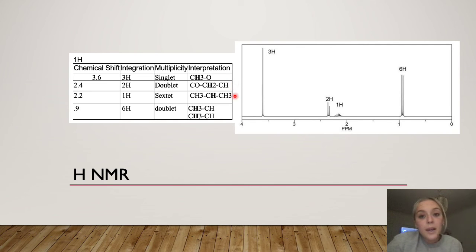And then I moved on down one further, and I saw this multiplet, which I looked at really closely. I zoomed in on it on my computer whenever I was attributing these, and I counted that out to be a sextet, so it would have 5 neighbors. And I looked and saw that this one is 1 hydrogen with 6, or it would be a septet, I guess. What, it's 5 or 6. If it's a multiplet, it's kind of hard to see. So I assumed it would have 6 neighbors, so it would really be a septet, I guess.